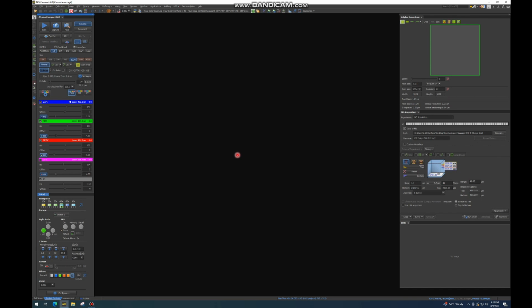During your second training, the Confocal Core Coordinator will help you set up the interface so that it looks similar to this.